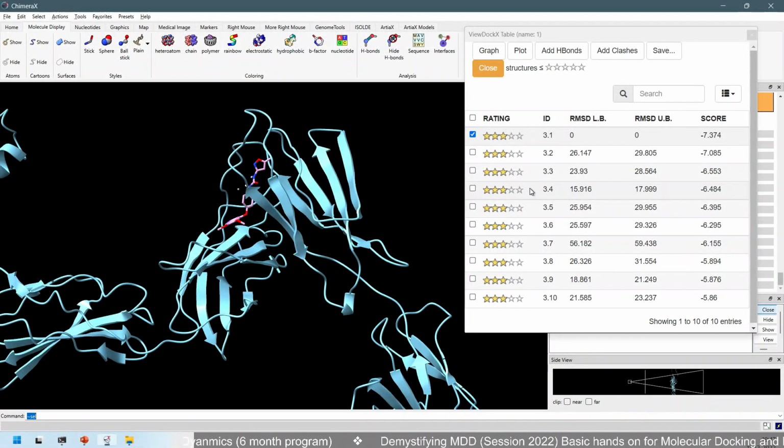And as we know, hydrogen bonds are formed when a hydrogen atom is present between two electronegative atoms. So for that condition, the software will be checking that some electronegative atom is present, like fluorine, oxygen or nitrogen, and that hydrogen is bonded to any of them, and then another group should be present where these electronegative atoms are present.